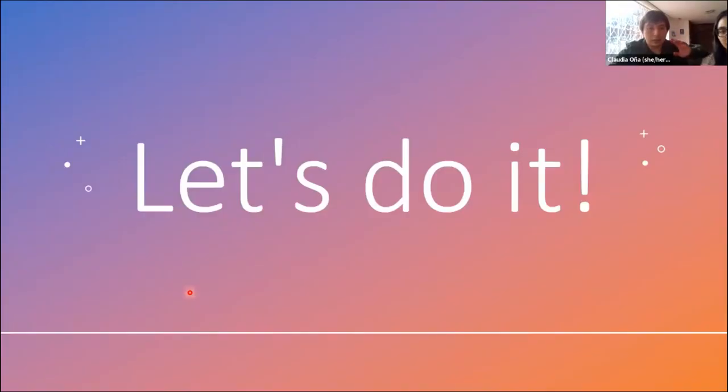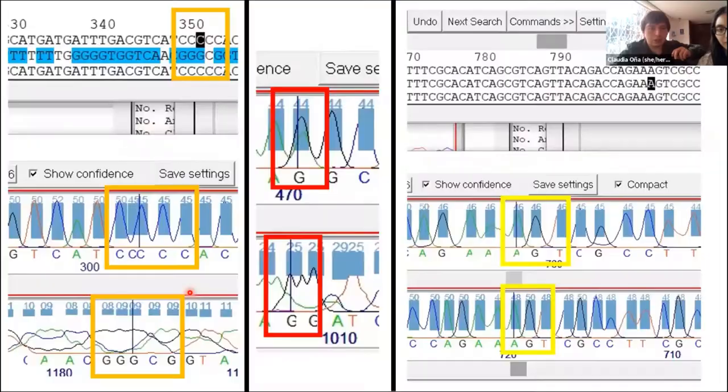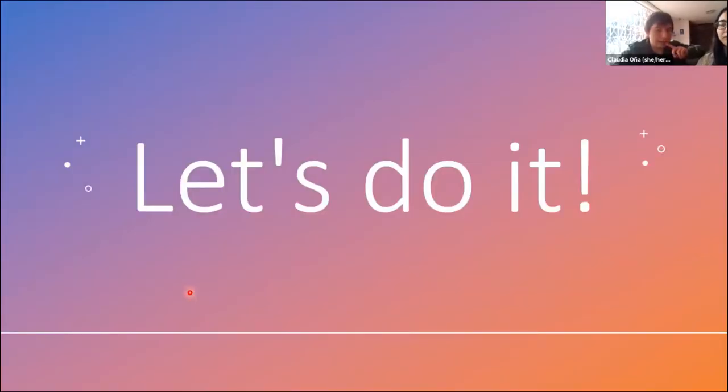So let's do this. As we put in the chat, you need to use the Staden package that should have been already installed. It is very easy to install. I think this is being recorded, so you can rewatch the tape if you want to do this and you don't have the software now.